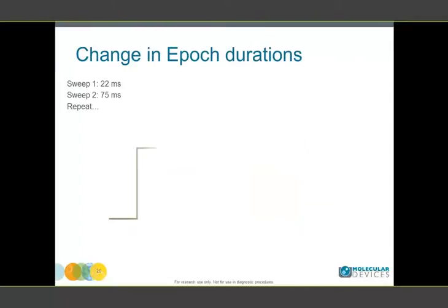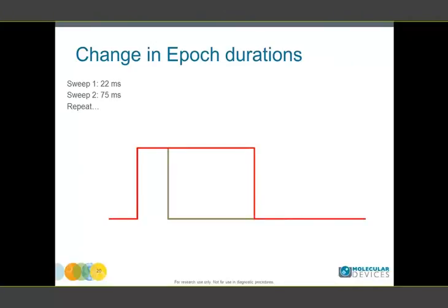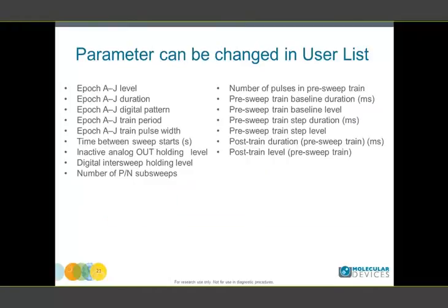And again, you can make it repeat. 22, 75, 22 again, and 75. I think these are very good features for you to customize your waveform.